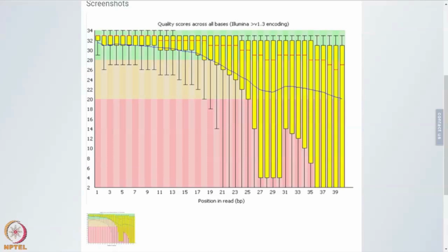What are you looking for when you are generating sequence data? You are looking for differences from the reference genome, which can be in the form of single base variations. And what are errors in sequencing generally? They are single base variations.